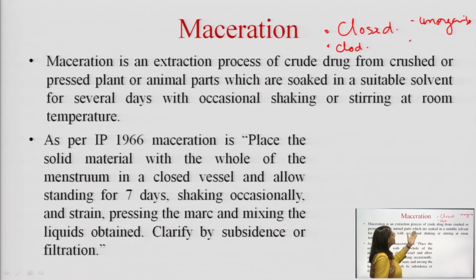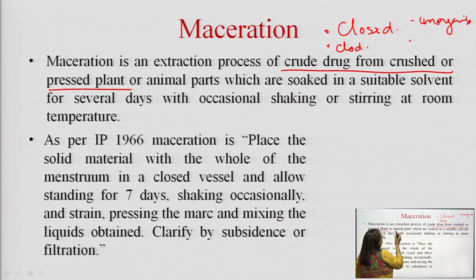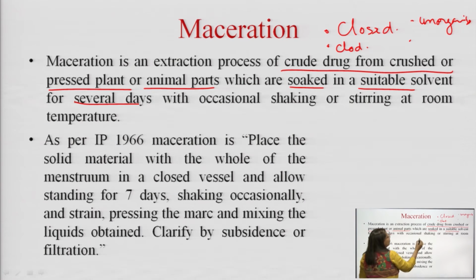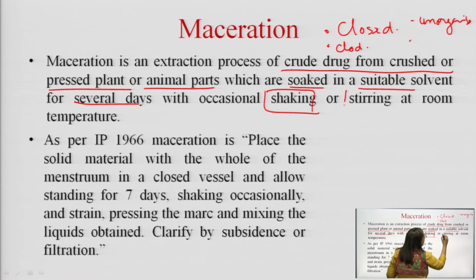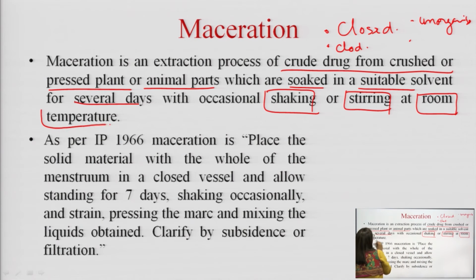In this process, crude drugs from either crushed or pressed plant material or animal parts are soaked in a suitable solvent for several days with occasional shaking or stirring at room temperature. This is highly important: maceration is done at room temperature.